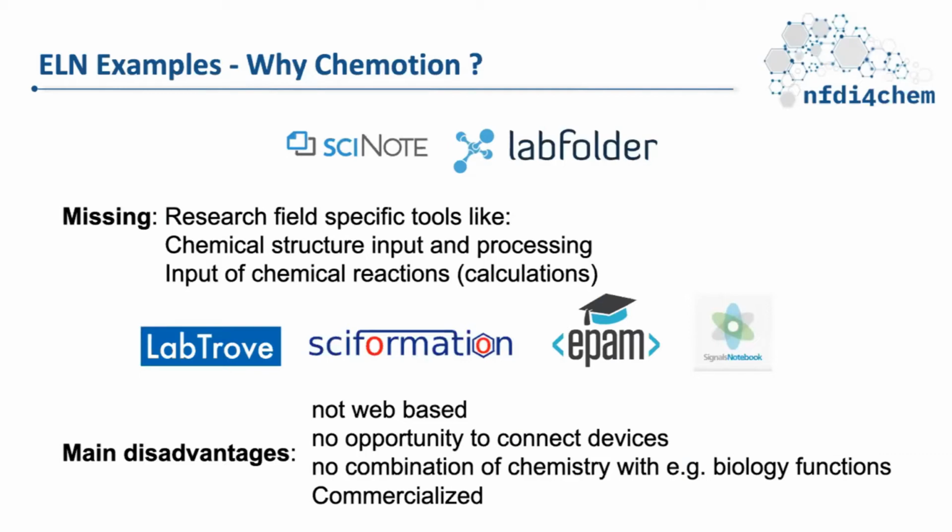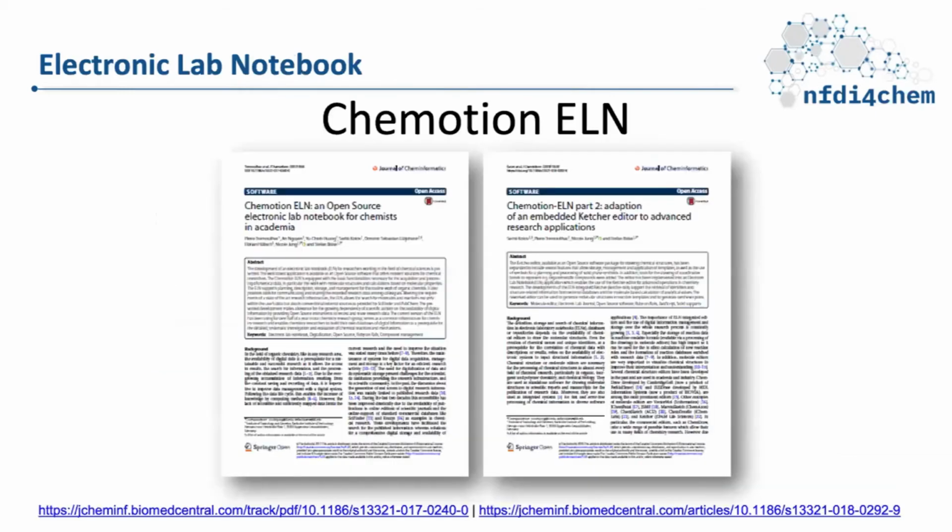And also there are several disadvantages of some of the solutions that are out there, which includes that the solutions are not web-based, and there is no functionality in order to connect to the devices, and also most of them are commercialized to a certain extent, and they are not domain specific.